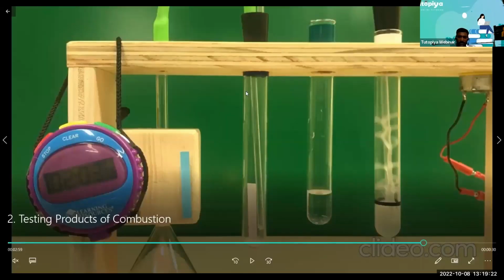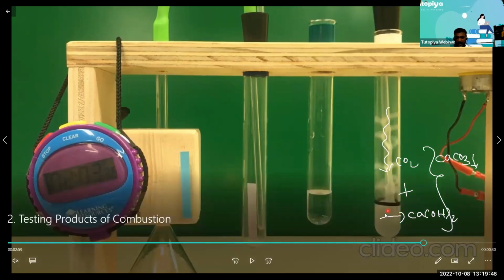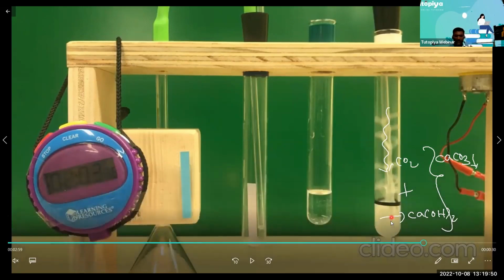Yeah. So, okay, this is calcium hydroxide. When it comes in contact with carbon dioxide, they both react. And when they both react, I get calcium carbonate. And you know, all carbonates are insoluble in water. So the calcium carbonate is also insoluble. You get precipitates of calcium carbonate here. That gives it a white turbidity because of the suspended calcium carbonate molecules.